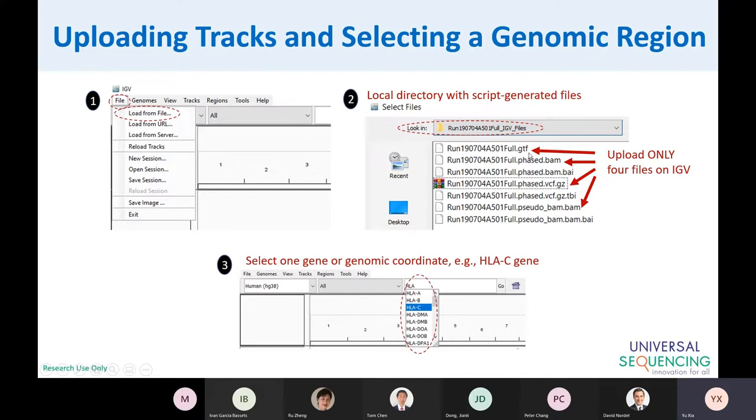And this gray box, this gray box, this gray box, and this gray box connect together. This forms another haplotype. And you may wonder why it is just a gray box, not the nucleotide. This is because the IGV by default, if the nucleotide here agrees with the reference genome, then that nucleotide character will not show up.